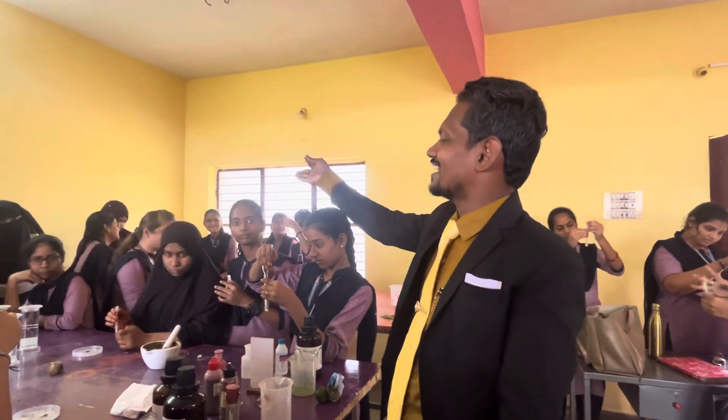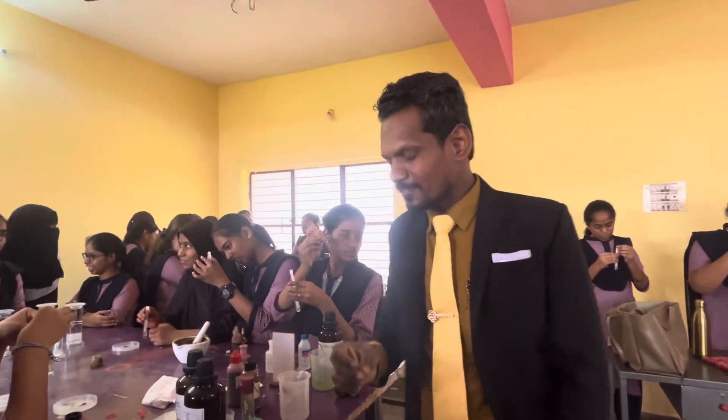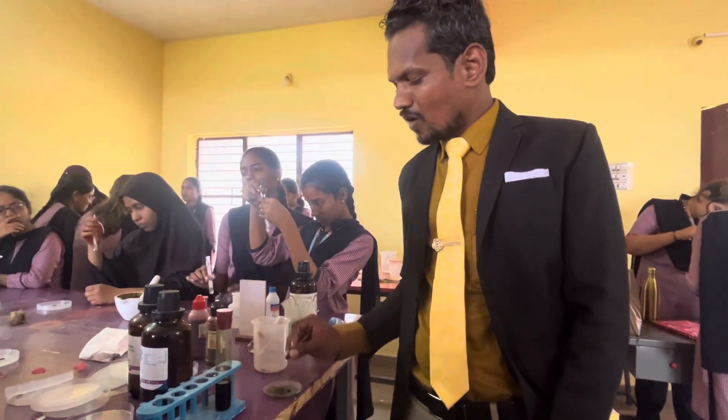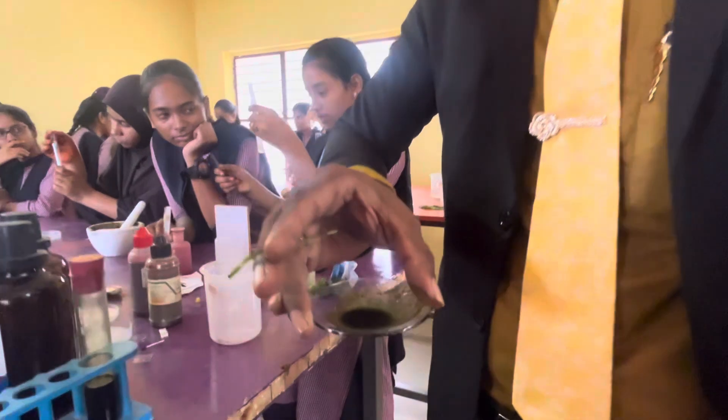Respectable everybody, our students are doing successfully. I am participating. So this extraction is prepared by our students — now I am going to add this extraction dropwise on the paper.